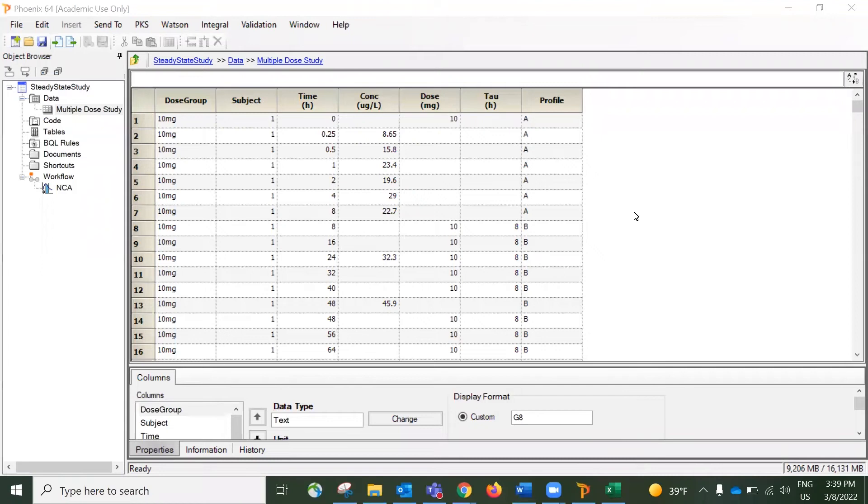This video discusses how to run a steady-state NCA using a multi-dosing datasheet, and I will discuss the PK parameters at the steady stage as well.